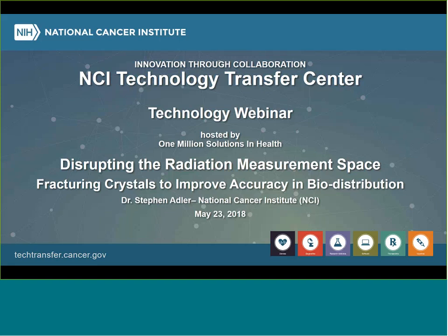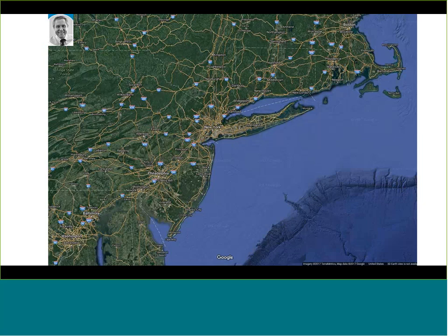All right, so now to start, I'm going to present the work that I've done in building a prototype of a microdose calibrator. And in order to entice you guys to come and listen to the talk, I put a very fancy title to the talk of Disrupting Radiation Measurement Space, Fracturing Crystals, and so on. But it's really a very simple design, but it's very effective. And I'll proceed to show you this.